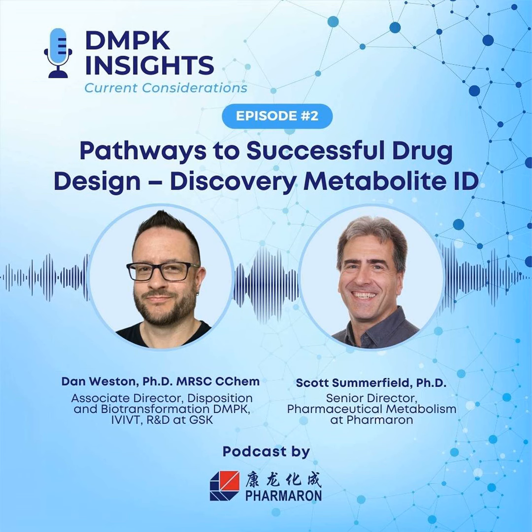So it's something that was non-negotiable for us, but really it's trying to shorten that time, so that once we get first look at data rationalization, what we feel is there from predicteds, and then other ways of trying to find more relevant non-predicted metabolites, either manually or with additional software assistance, which is something that we're currently looking at. It makes that something that is a comprehensive look, but we've removed a lot of the manual scan by scan for the predicteds.